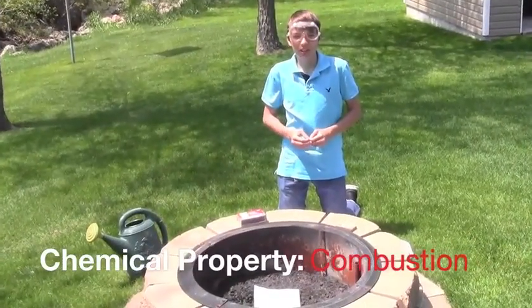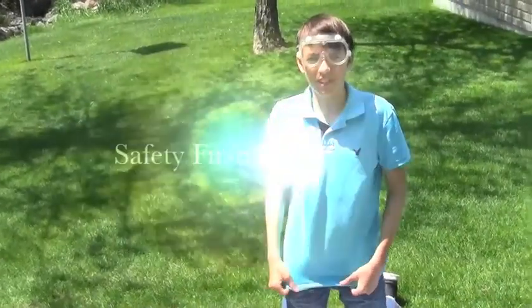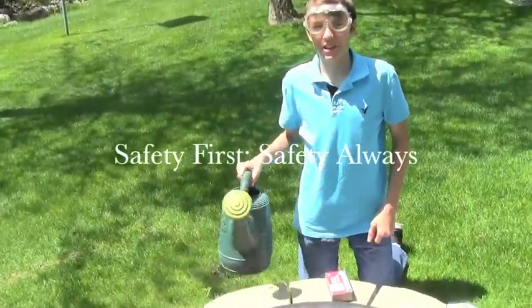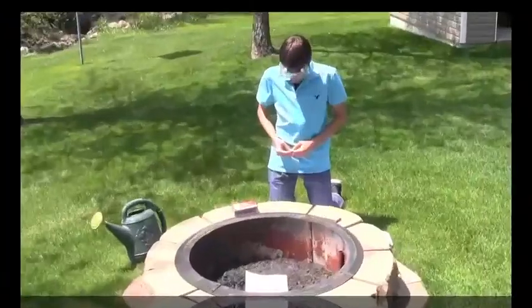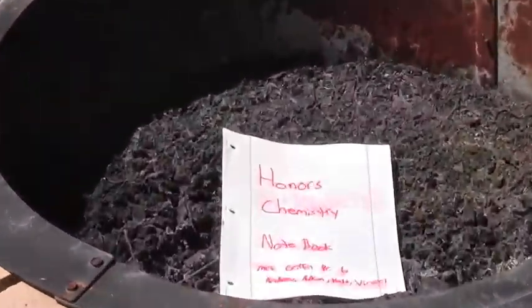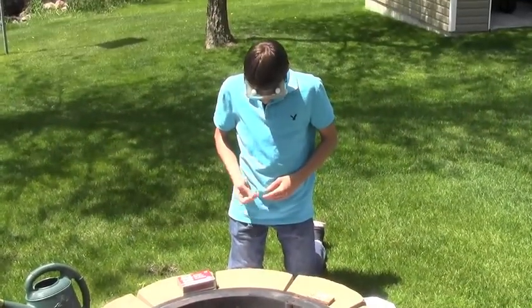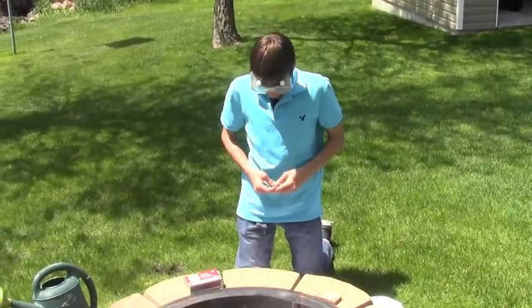The property we're going to show you is the ability to burn, also known as combustion. In case this combustion gets out of hand, we have this safety water here to put the fire out. Let's just say we don't like this chemistry notebook because it kind of ruined our lives. Who would ever think that? This is all hypothetical, of course.